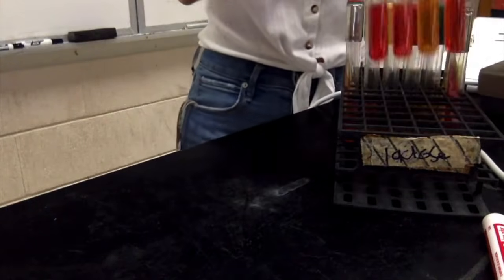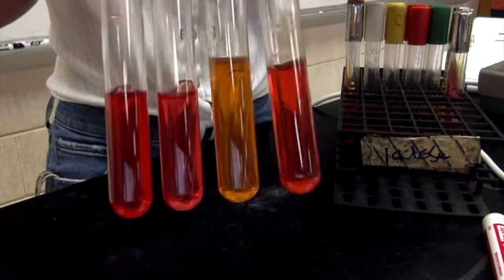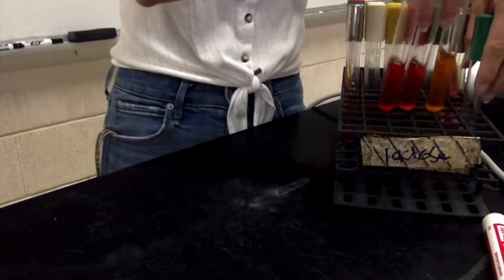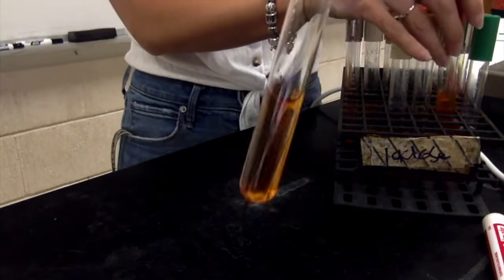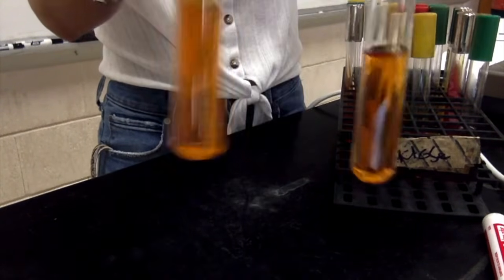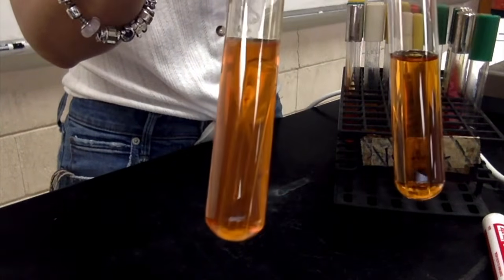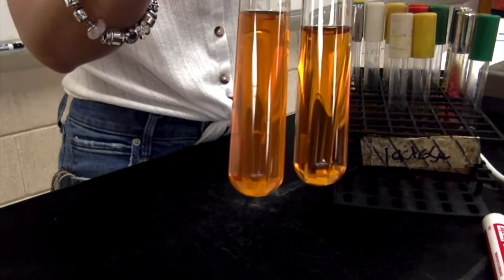If you look at all four tubes, they're all negative. Now, the glucose, which is this one, looks a little orange, but it's like that because it started out that way. So here's a complete negative that doesn't have anything in it. Here's the Pseudomonas. Glucose starts out as more of an orange color instead of red. Now, with the Pseudomonas, you can see there's growth there. The bacteria grew, but it respired.